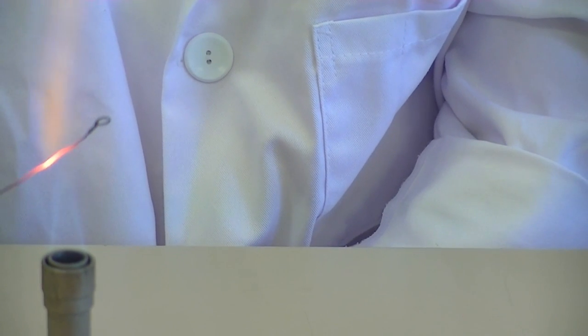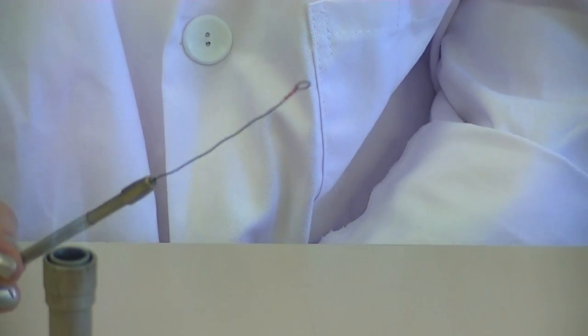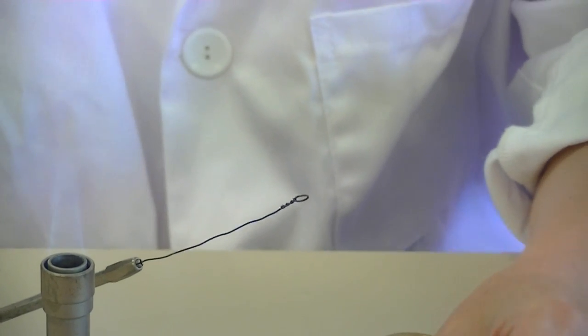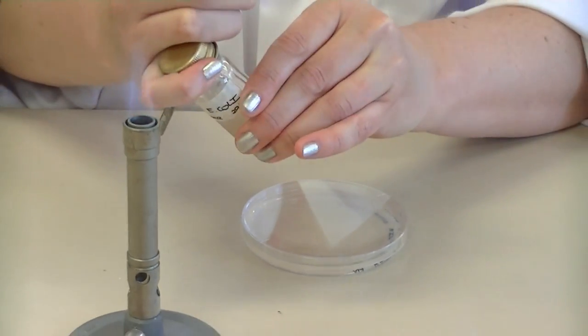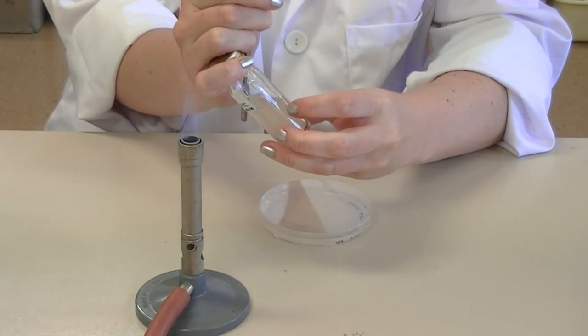Because we are collecting a broth culture, you want to make sure that the actual stem is sterile as well, since a large portion of it has to go into the McCartney bottle to collect the culture. You need to do this aseptically by loosening the lid of the McCartney bottle using the crook of your finger.